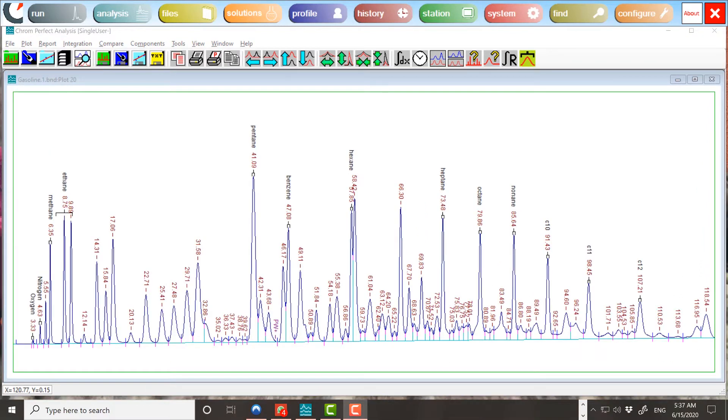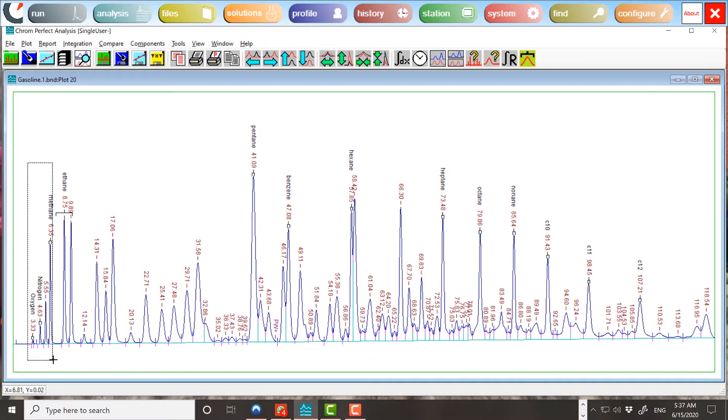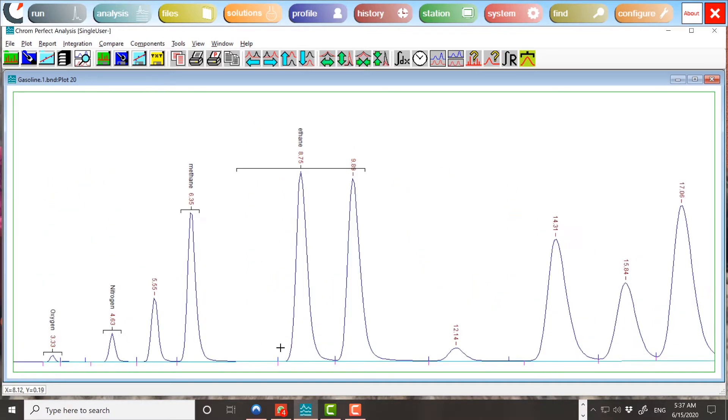Identification is a one-to-one relationship. No component may be identified with more than one peak and no peak may be identified with more than one component. This essentially simple process becomes complicated when search windows overlap.